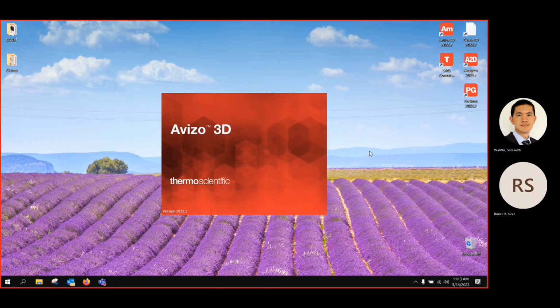Yes, just only one time. Only one time when you want to switch between the environments. So by default, it's the embedded environment. But if you want to start using deep learning, you can switch to the deep learning environment. And most of the Python packages in the standard workroom can also be used in the deep learning environment as well.